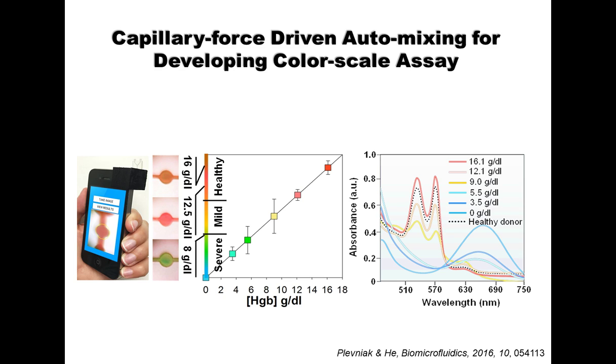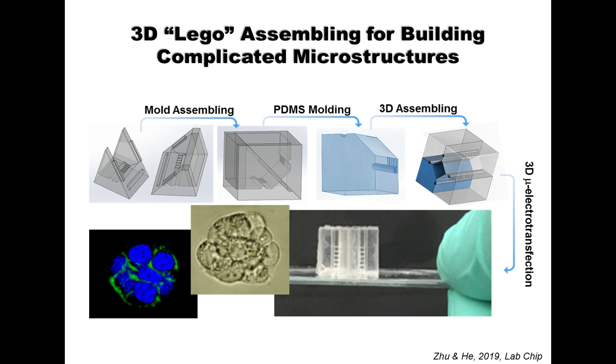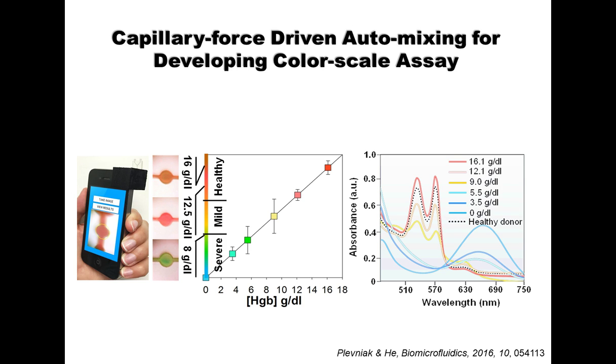And meanwhile, we developed reagents which can introduce a redox reaction with a single blood drop, and undergo the redox reaction to produce the solution into the color display.